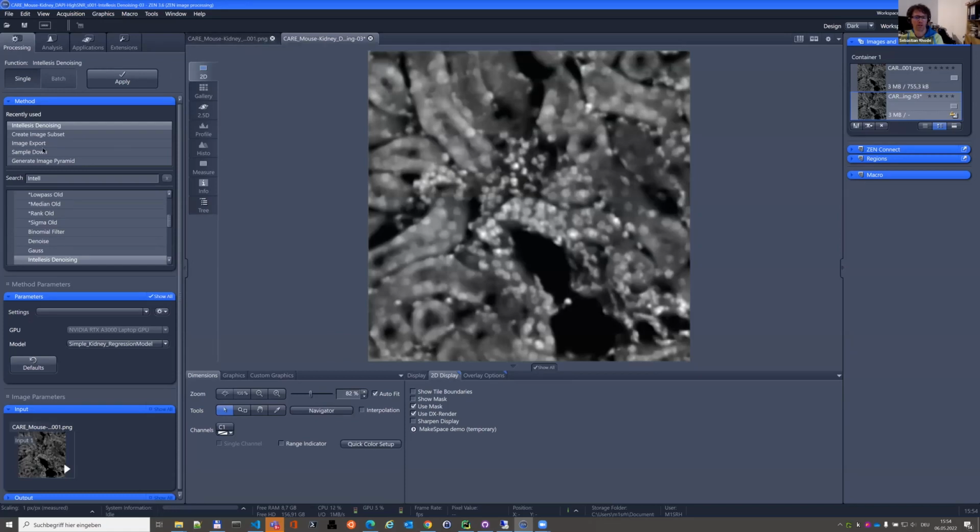This is super flexible. Yes, it's called denoising because it was initially developed for the Noise2Void function, but it can be used for any regression model. Okay, that was quite a lot. But I'm happy everything worked, especially also not for me. This one thing why it doesn't work for me, I don't know, but when it worked for at least one person in the audience, then it's probably not the code, it's something else.